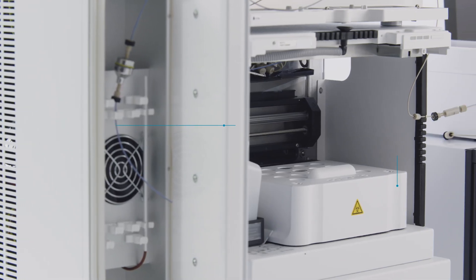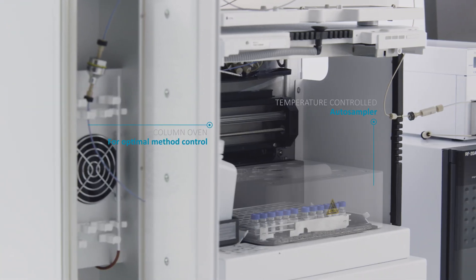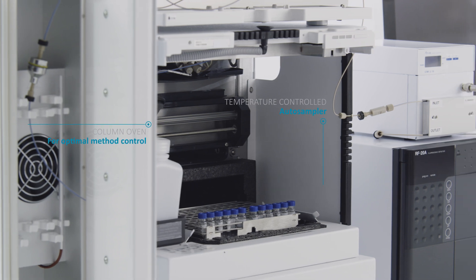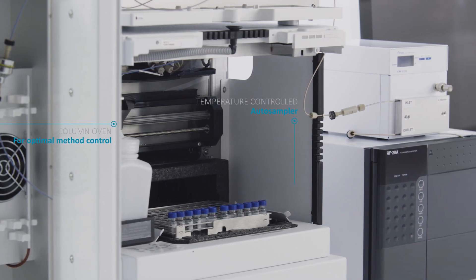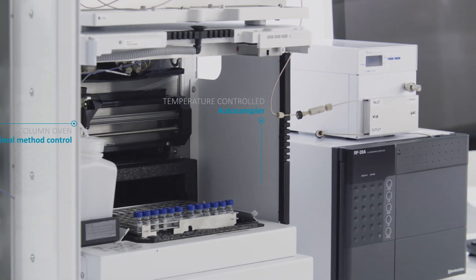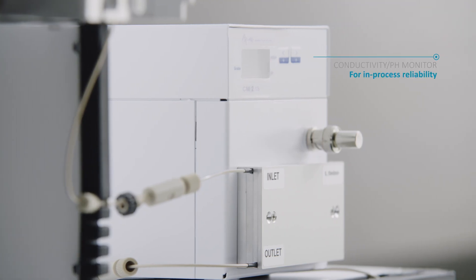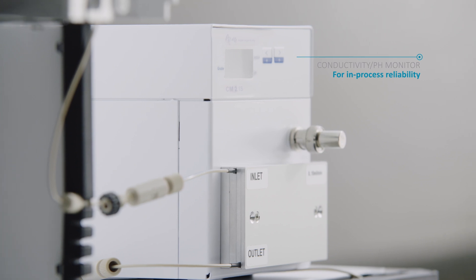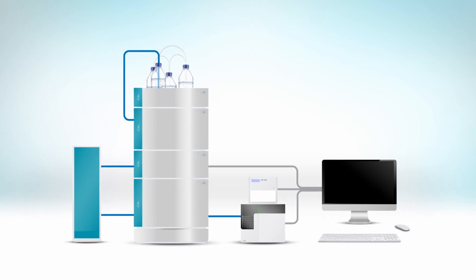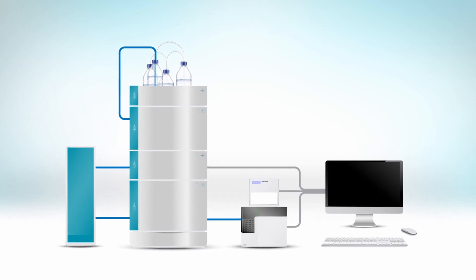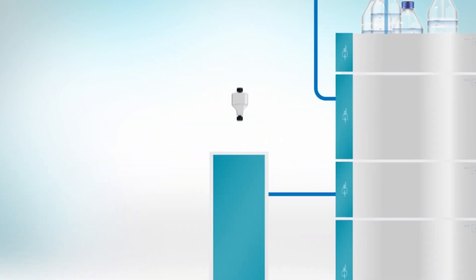Especially for complex biological mixtures and with samples frequently varying only in confirmation, minor modifications or viral particle composition, a platform solution should go beyond just the pure hardware though.